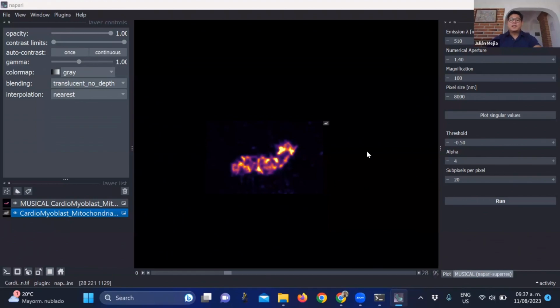No, it's not the raw result, it's the whole reconstructed image. Remember that you work in a ROI and then you stitch together the results of each of the ROIs, and then you reconstruct the full image of your data set.